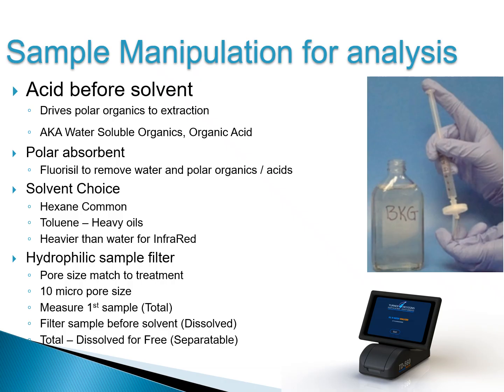It doesn't have to be any specific type of acid, but getting the water to a very low pH makes the solvent much more efficient at removing organic acids. So if you want to know how much organic acids are in your water sample, making a measurement with and a measurement without the acidification process will tell you organic acid presence.